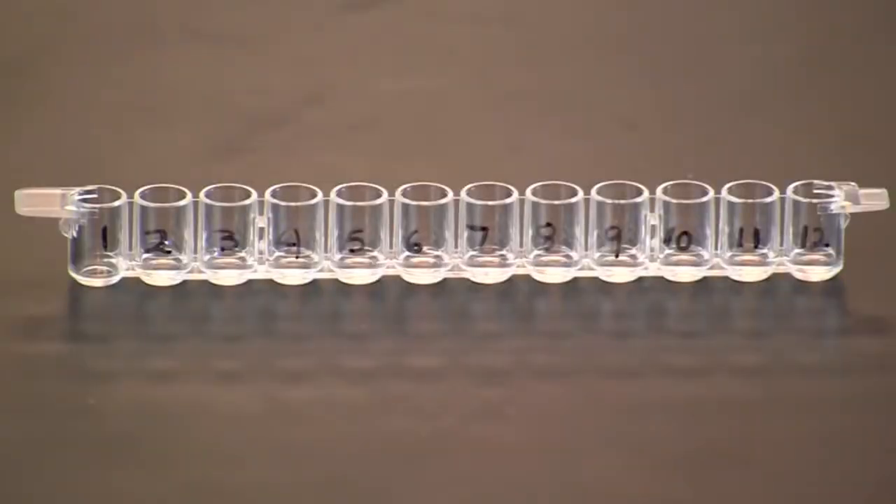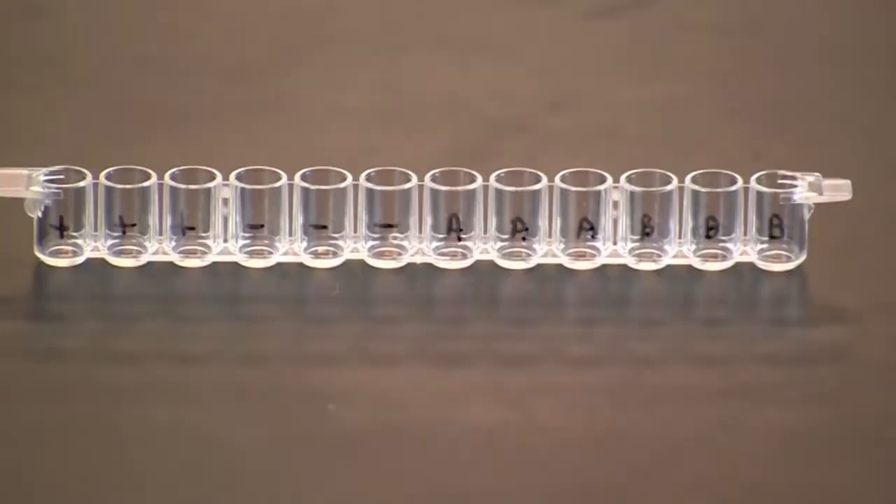First, label a 12-well microplate strip. Label the outside of each well sequentially from 1 to 12. These wells will contain the standards. In a second 12-well microplate strip, label the first three wells with a plus for positive controls and the next three with a minus for negative controls. Label the last two sets of three wells for the test samples.